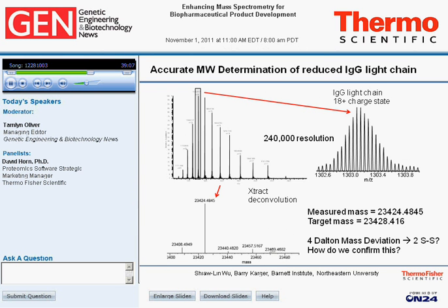So now we're showing an example of the IgG light chain. Now we're back to the same IgG that we were using with the Q Exactive data. And one thing we noticed, so we reduced the IgG light chain from the heavy chain, from the intact antibody, and then we ran LCMS on it.